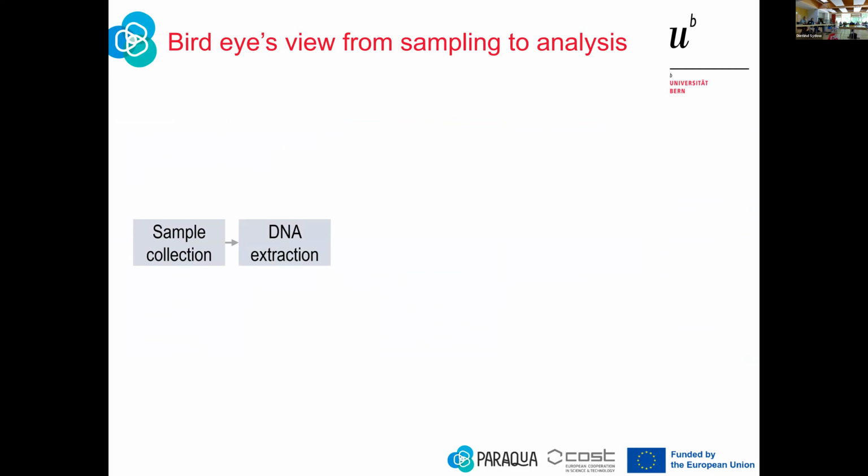And I actually don't know, but I think, Simone, you have struggled with DNA extractions from your organisms. If you just use the standard sets of tissue extraction or something that's made for mammals and soft cells, they are not necessarily the best way to get the DNA from something that is encapsulated in a spore, in a cyst or something.